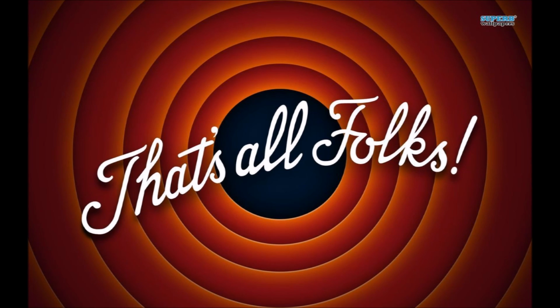And, well, that concludes this video. At least the first of 3. Tune in next week where we go back to the alum crystals to see if you can see them now with the naked eye.